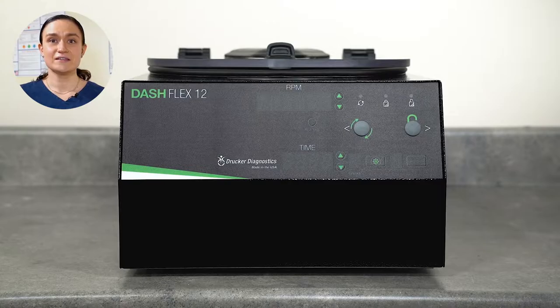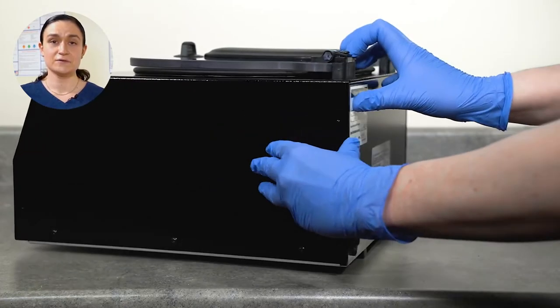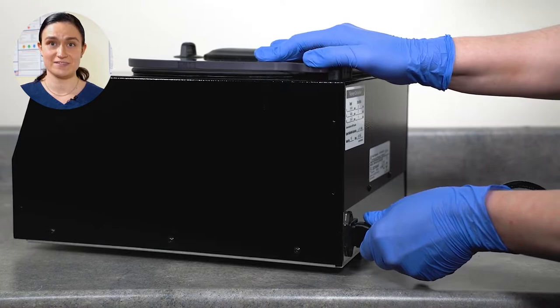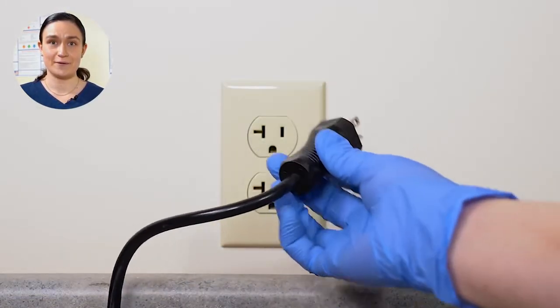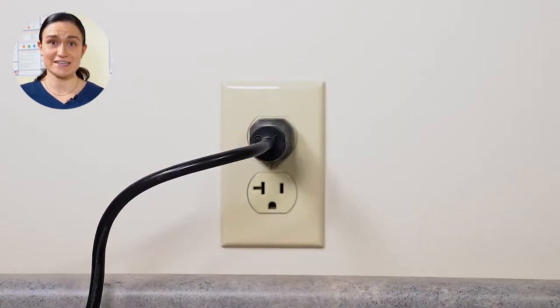Next, locate the centrifuge power cord and turn the centrifuge so that the back is visible. You will need to plug one end of the power cord into the back of the centrifuge, then plug the other end into a wall outlet. Make sure that wall outlet is easily accessible because this is the emergency disconnect, and you'll need to unplug the centrifuge anytime you need to perform cleaning or maintenance.